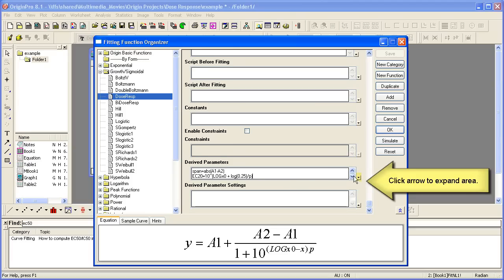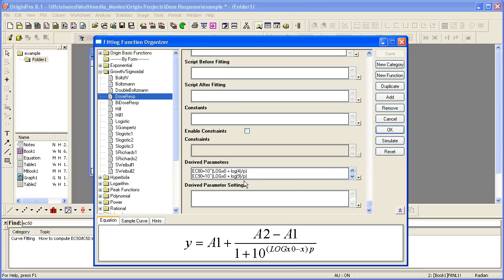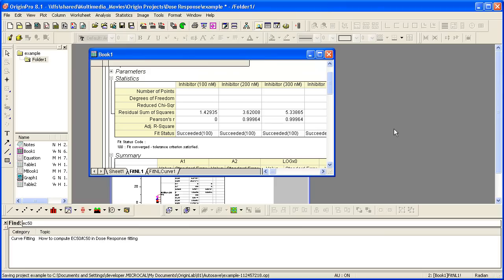And this is where I can add EC90, so I'll paste that in. After doing that, I just want to click outside the box, and then I can save the function, and then we can close the dialog.